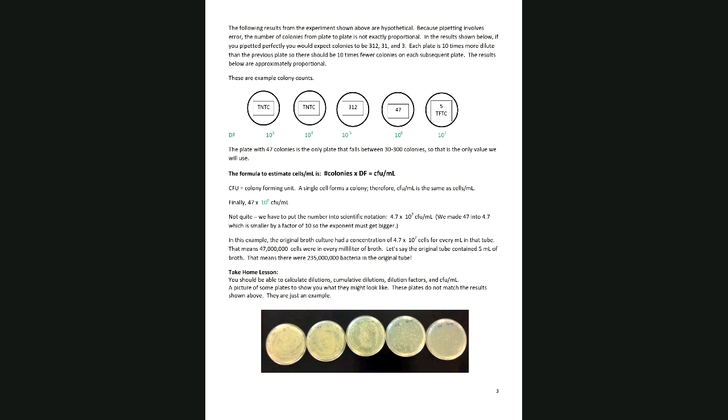And so it's interesting to see if the web estimate is very close to your actual results you get when you do the experiment. And if they are very close, then that means your technique was really good. If your calculated value is way off, then that means your technique was not very good. So it is interesting to use that for comparison.